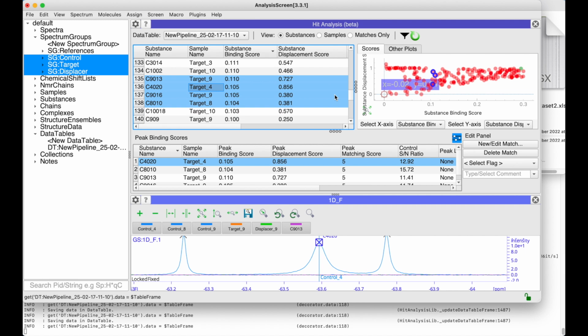We hope that's given you a nice little bit of an overview of the way in which the screening program works. We're now in the process of updating some of our documentation, and you'll be able to have a look at specific elements there. And obviously there are also other ways of doing this if you want to do things rather more manually rather than using the pipelines, or if you want to use reference mixtures, which is something which we advocate, particularly in situations where you find that your peaks will move quite a lot between different screens or between your references and your controls.